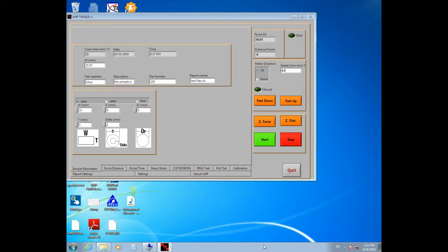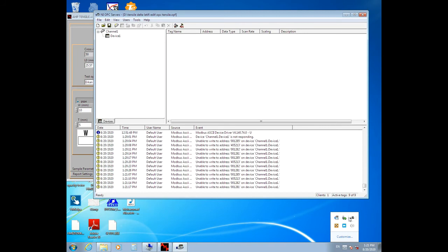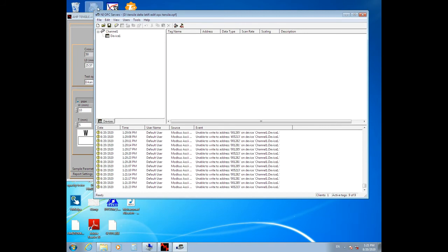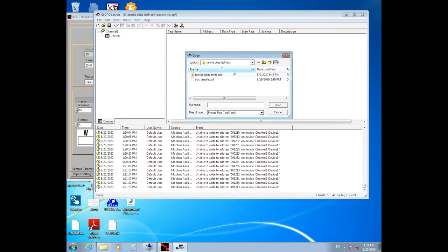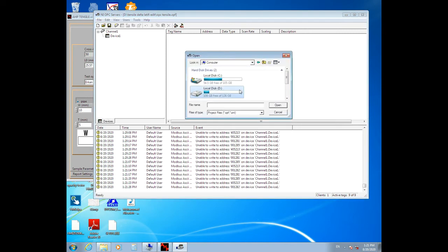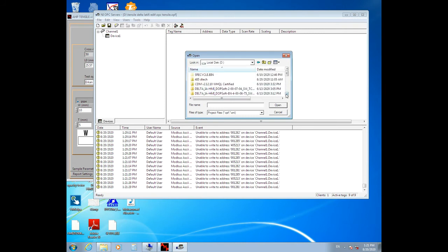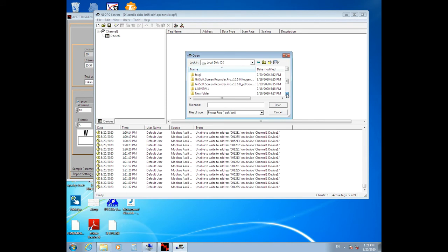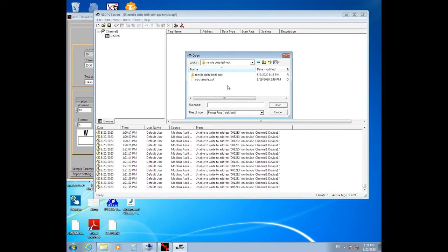From the right bottom side of your Windows, click on NI OPC Servers, click the Open button, go to Drive D, open the Tensile Delta folder, and open the OPC Tensile.OPF file.